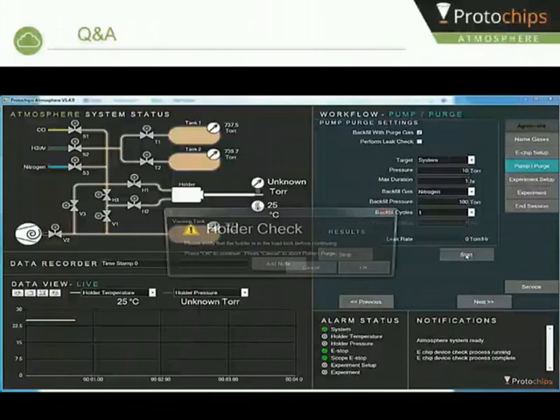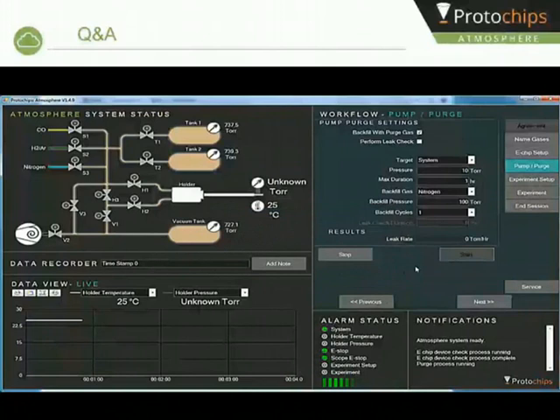Fantastic. I believe this is a question for Larry, as it came in while Larry was presenting, but do jump in if you think it's for one of you. On one of your graphs, there was a ramp of temperatures, and you used 5% palladium. A delegate wants to know why you used 5% and not another percentage of palladium. I don't think that's a question for me. We didn't have 5% palladium. It was less than that, I think, if I'm not mistaken, maybe 1.5%. The point is, we used an odd-looking pressure of oxygen because we were trying to mimic the oxygen pressure in Albuquerque. So we used 130 torr of oxygen, but we certainly did not use 5%, and I believe it was lower than that. Okay, thank you.